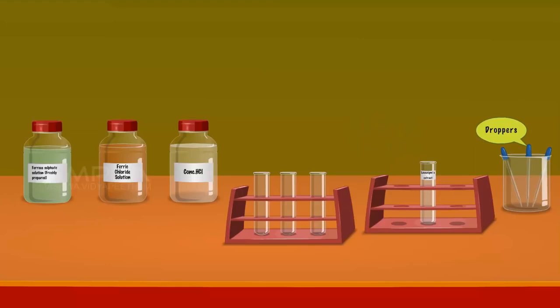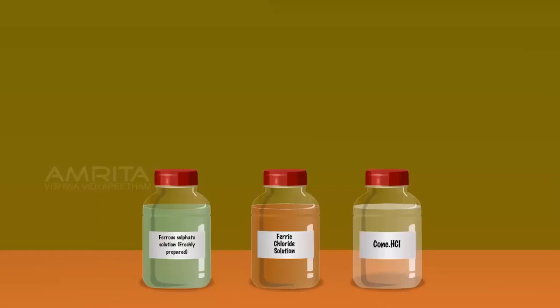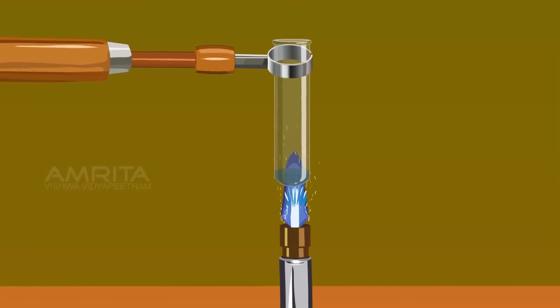Take a small amount of Lassaigne's extract using a dropper and pour it into a clean test tube. Using another dropper, take a small amount of freshly prepared ferrous sulphate solution and pour it into the test tube containing Lassaigne's extract. Hold the test tube with the test tube holder and heat it over the Bunsen burner. The sodium cyanide formed during the preparation of Lassaigne's extract is converted to sodium ferrous cyanide on treating with ferrous sulphate.